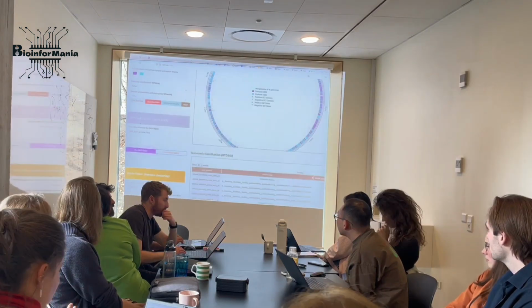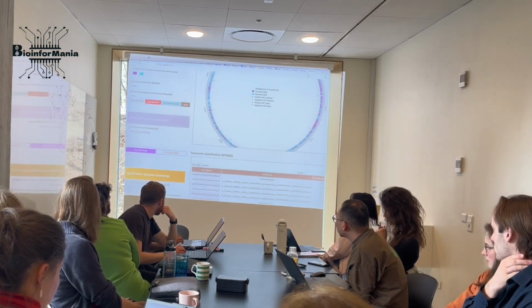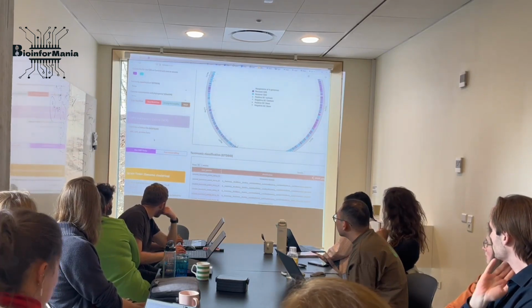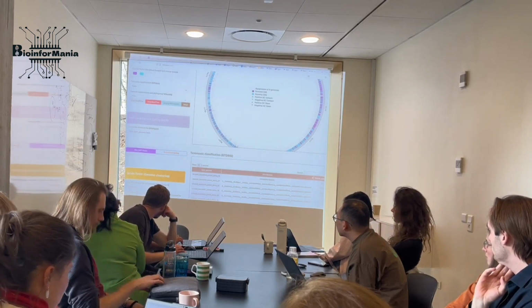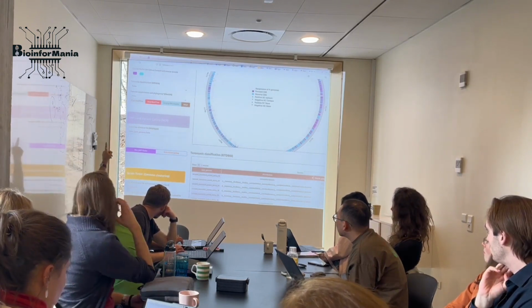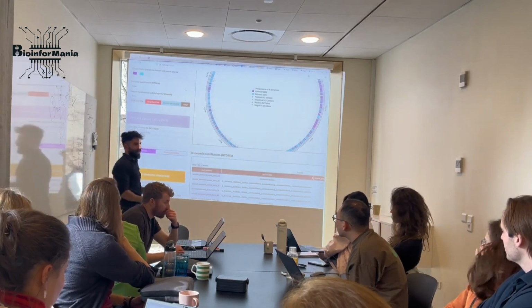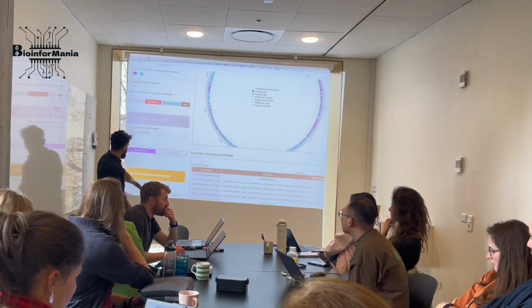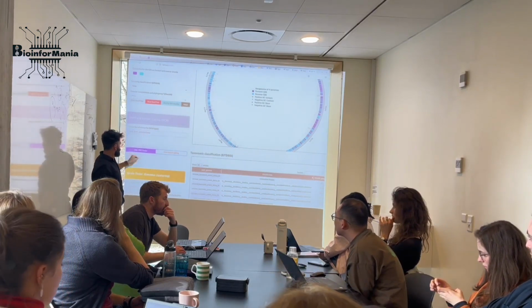If you want to see if there is any structural variance, single nucleotide polymorphism, or polynucleotide polymorphism, or structural variance, whatever, you can basically go here. You have the genome directory of FASTA up there, and you want to compare all those FASTA files to a wild type, like their mother or something else that you have done some modifications to. You give the absolute path of that FASTA genome.